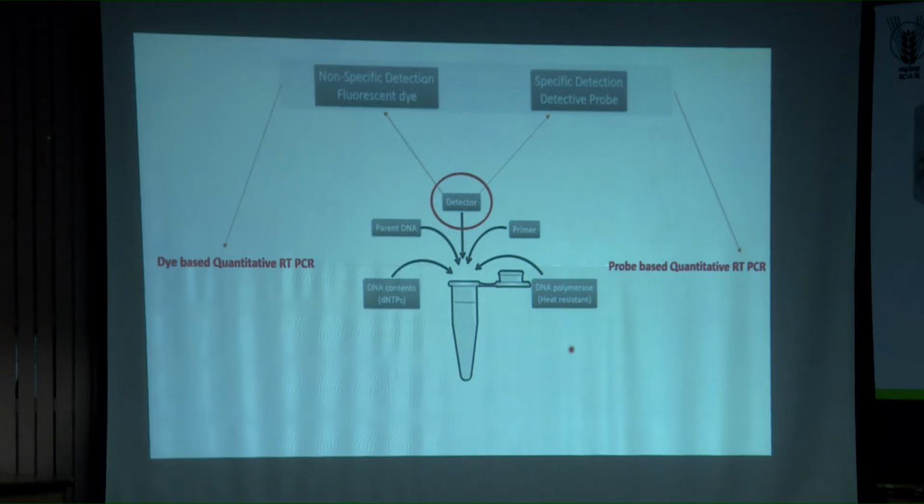I'm just asking relatively, if you grade it. Enzyme? Of course, this enzyme is so important, no doubt. But I would rate the primers as very important. Suppose you want to amplify a specific target, the primers are so important. All are equally important, no doubt, but primers are directly impacting your progress.